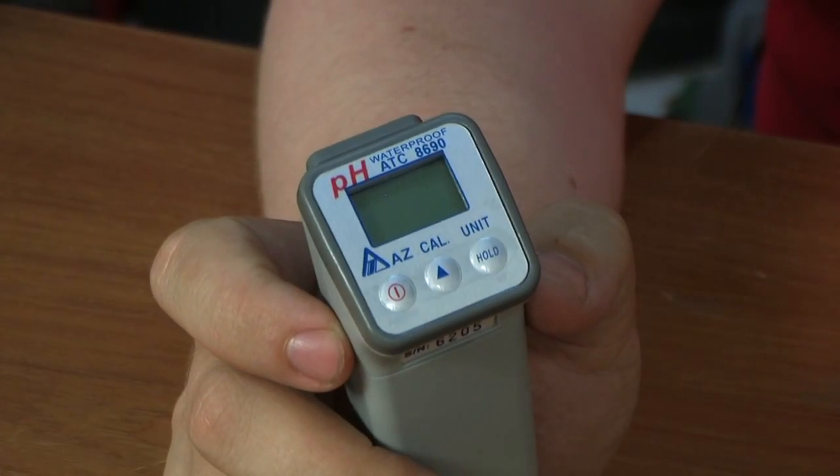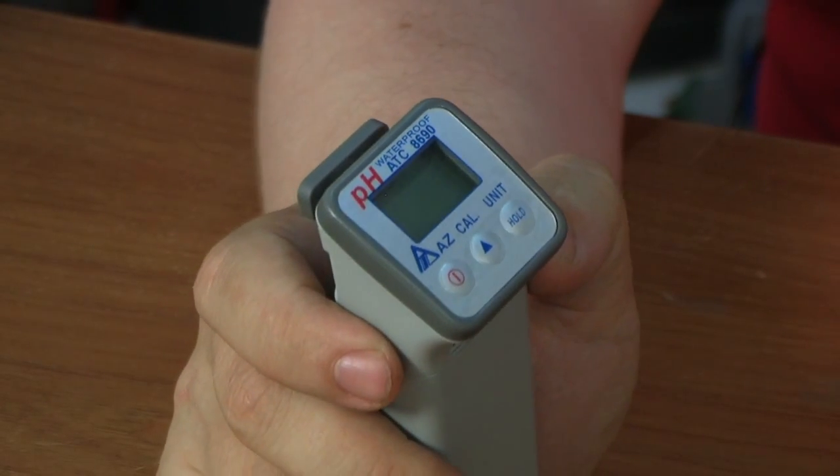The pH meter, model 8690, has a double digital display placed at an angle of 45 degrees. Calibration and temperature compensation are automatic. The pH electrode can be replaced.